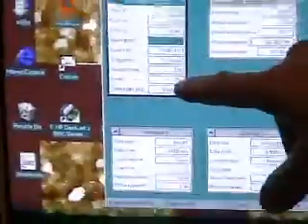Tip velocity is something that it calculates by combining the scan rate and the scan size. I don't actually use that myself too much. I rely on this table to choose my scan rates pretty much, although sometimes I go a little bit slower than this if I want to get a really good resolution scan.